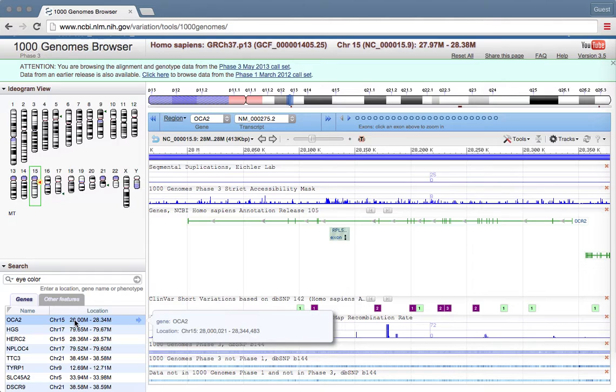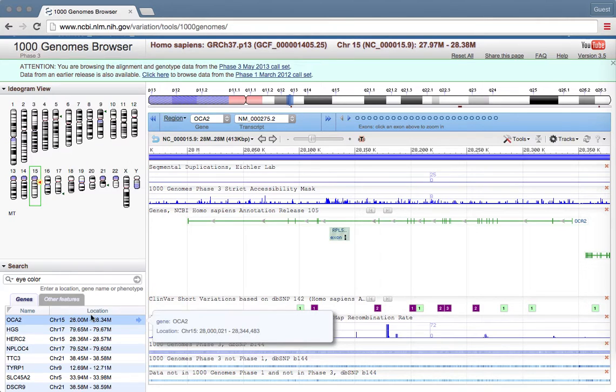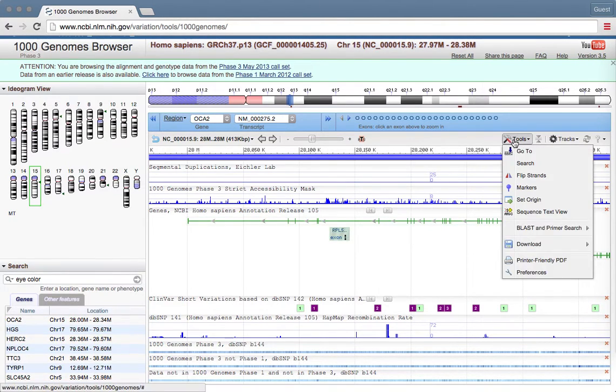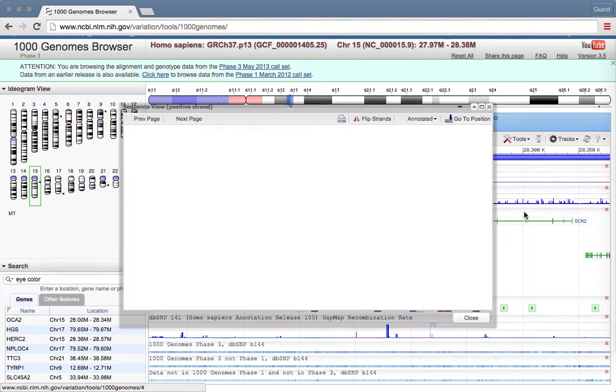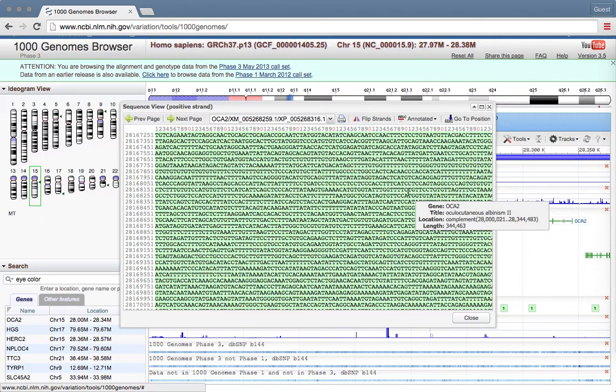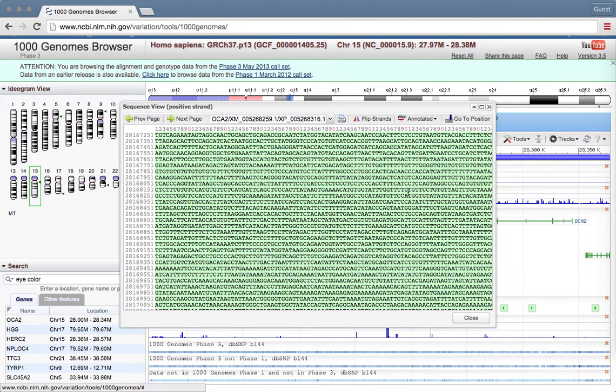The other cool thing that we can do with this is to look up the exact DNA sequence of this gene. We can do that by going over to Tools and clicking on Sequence Text View. If I click on that, a box will pop up with a bunch of letters and this is the actual DNA sequence of the gene.